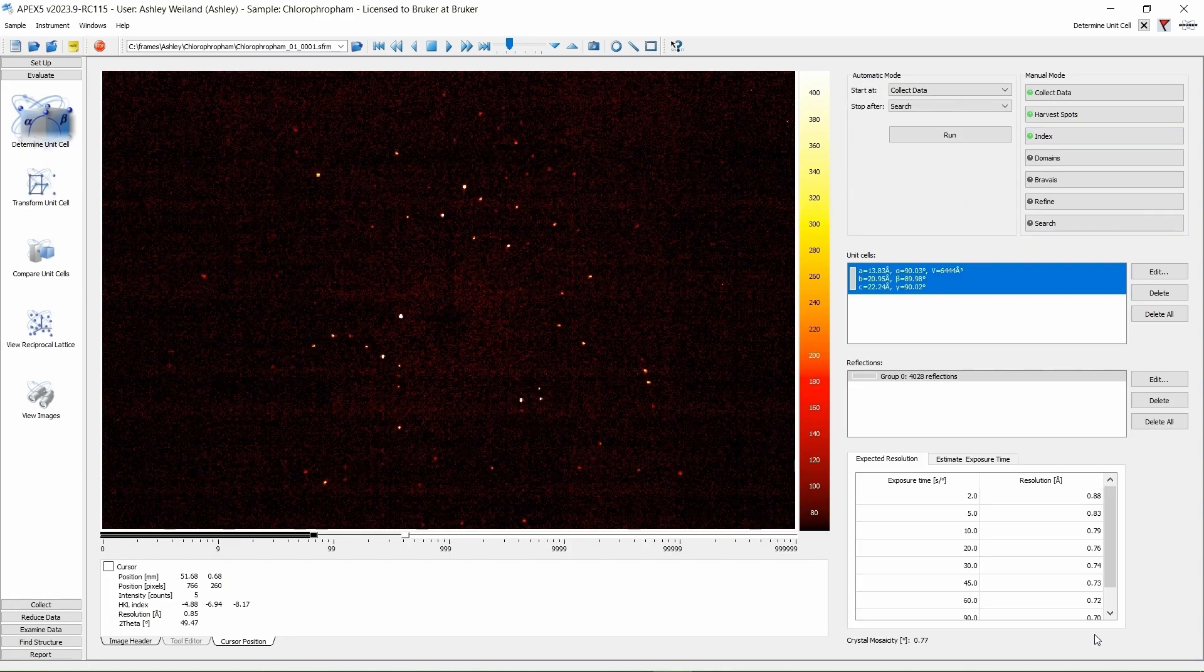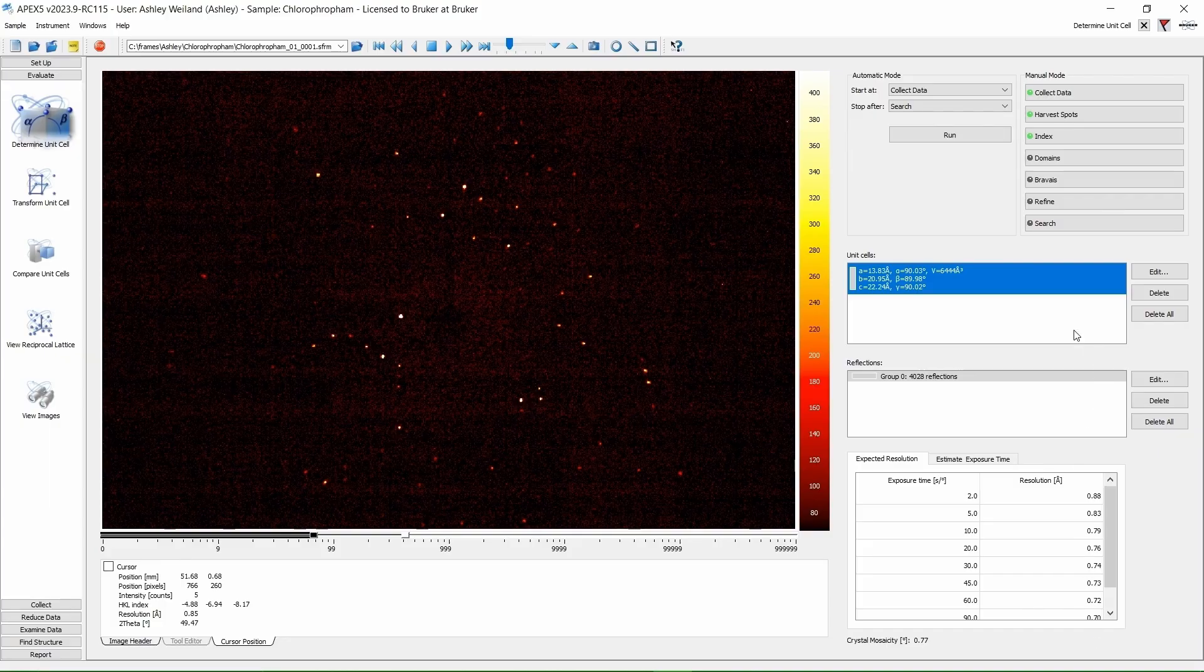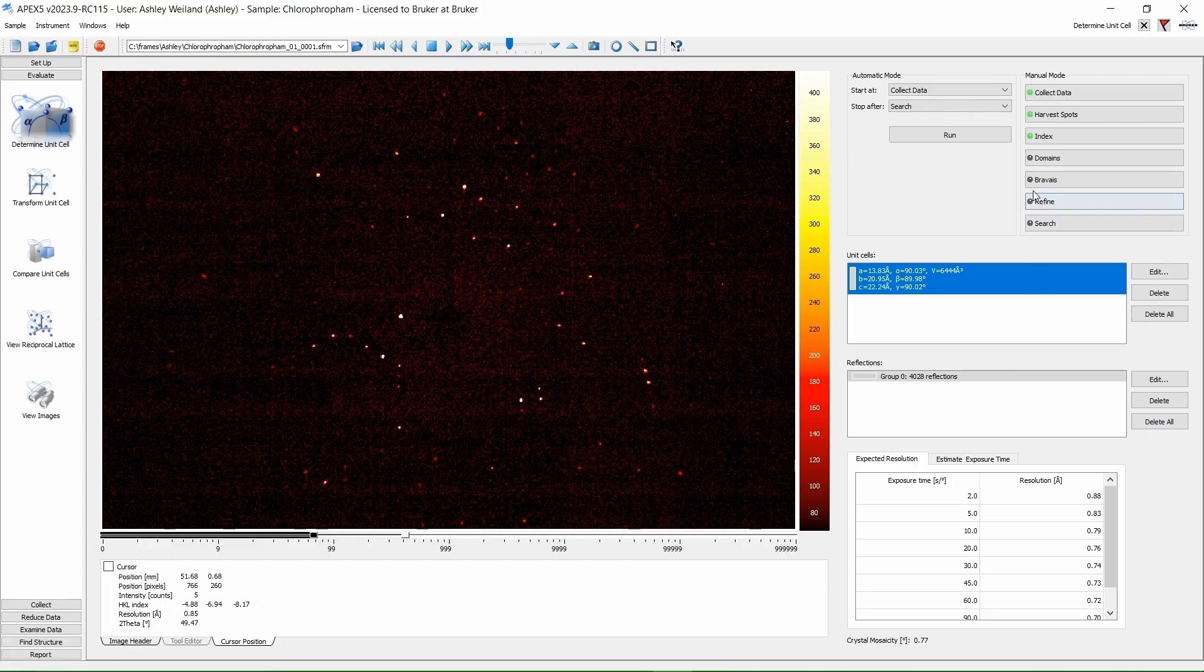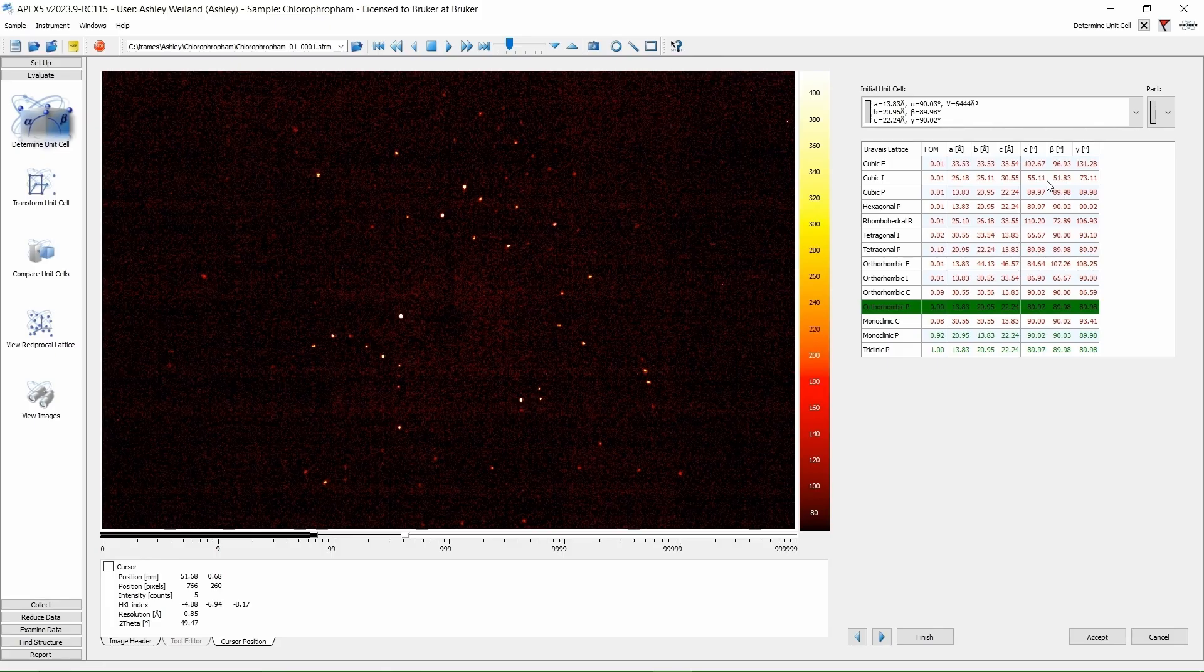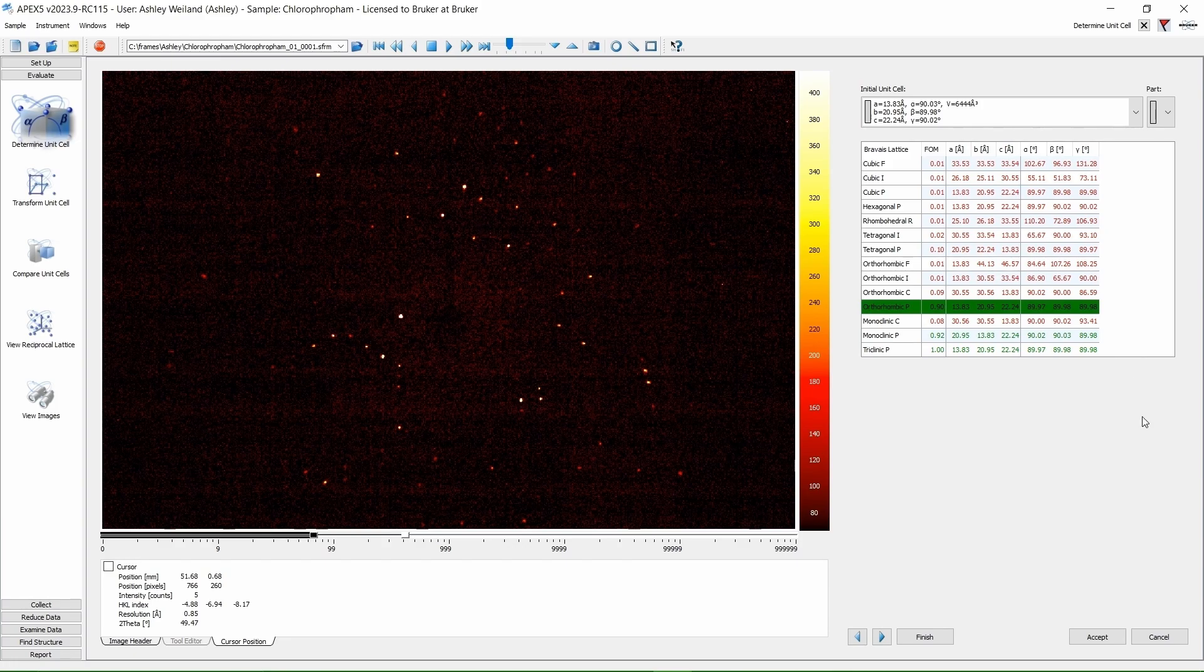We are going to skip the domain section for now. We will have a more in-depth discussion about that in another video. For now, we are going to click on BraVe. This is going to give us, in green, the BraVe lattices that our data fit best. In this case, Orthorhombic P is selected. I am happy with the suggestion because even the Monoclinic P option has three angles very close to 90 degrees. Click Accept.